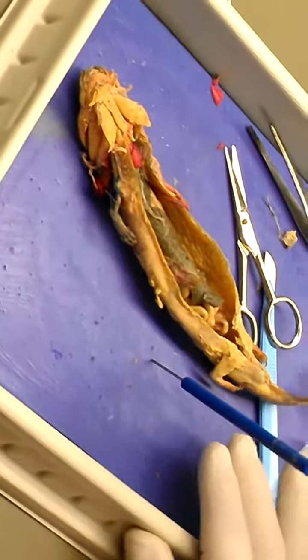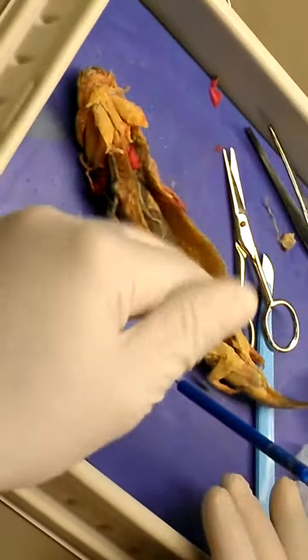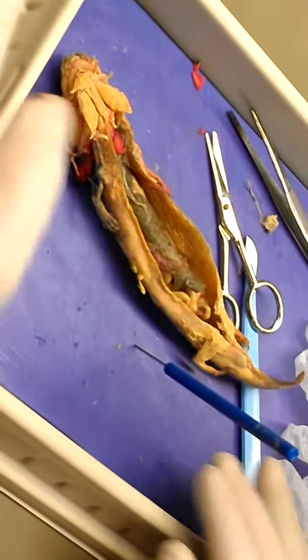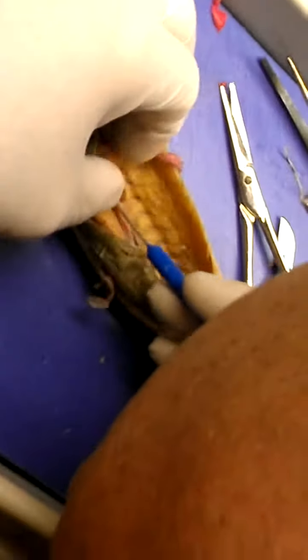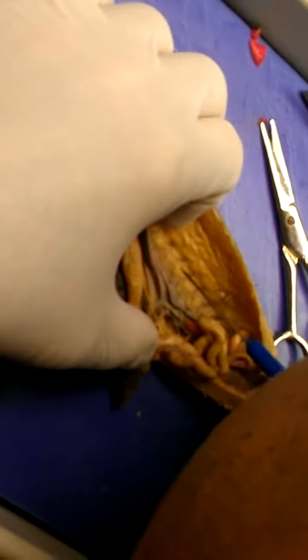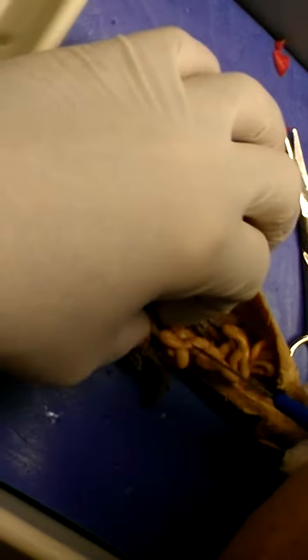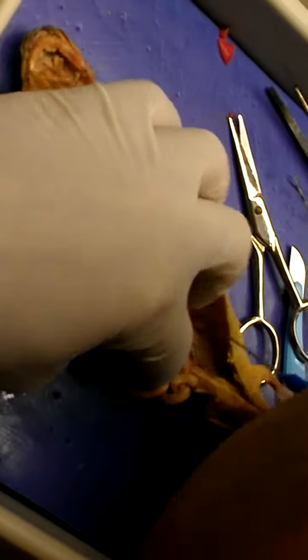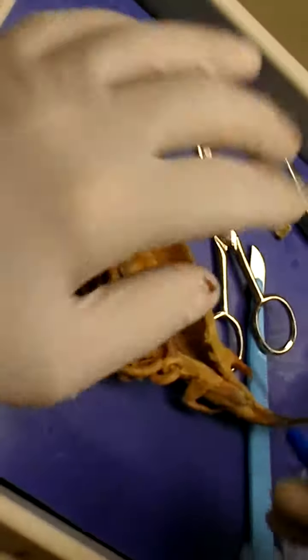When you go to do the blood vessels, they don't always match up the way you'd like them to match up. Okay. By that I mean you're going to come back here and you're going to pull this forward and you're going to start to look at the aorta. Okay, so there's the aorta right there. Opening this up right here so I can see the aorta. And I've got some blood vessels coming off the aorta, right? And I've got a blood vessel coming off the aorta that's going to the pancreas. And I've got a series of blood vessels that are going into the kidney, okay?